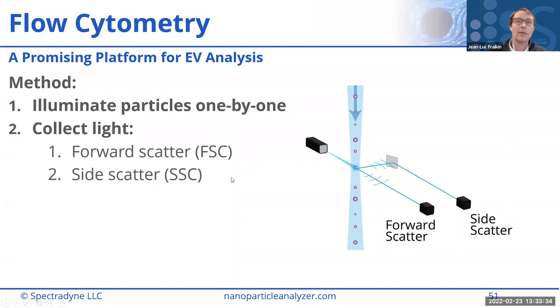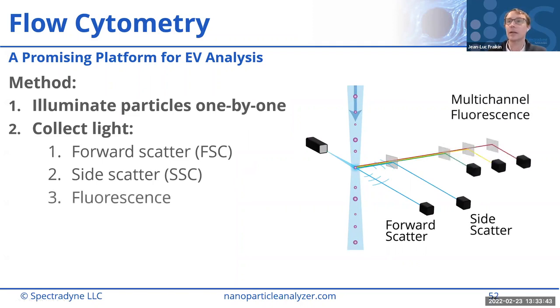And then if you illuminate with an appropriate fluorescence excitation laser, then you can also collect fluorescence information from single particles as it goes through. And these days, flow cytometers, they're approaching spectrometers, right? There can be so many fluorescence channels on this detection path that you can almost get spectroscopic information about particles individually. It's really incredible, especially obviously for larger particles.